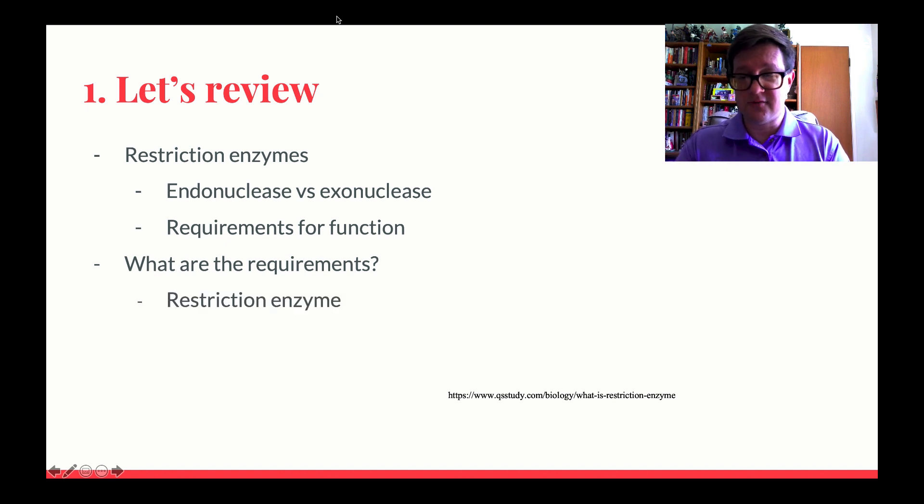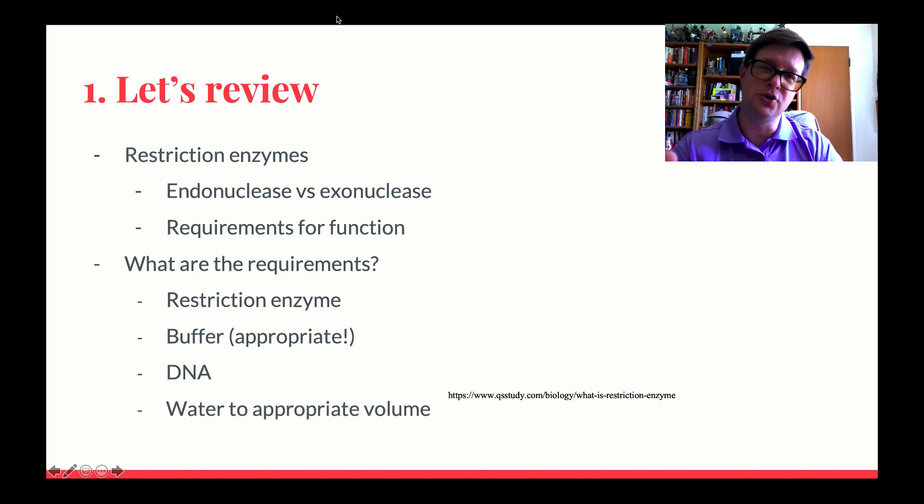That's why in that lab you had some of your gels that turned out to be total digest and some that turned out to be partial digest, and that's because you didn't give them the correct environment. So what are those requirements? Of course, if you're going to run a restriction digestion, you need to make sure that you have the enzyme. Make sure you give the correct buffer. We need to make sure that you also add some DNA, and we usually put these to the same volume every single time. So we usually add water as is appropriate.